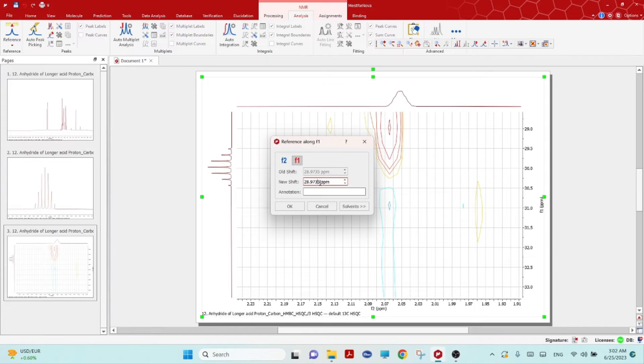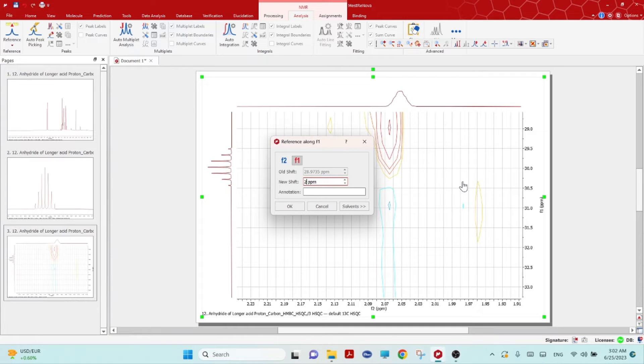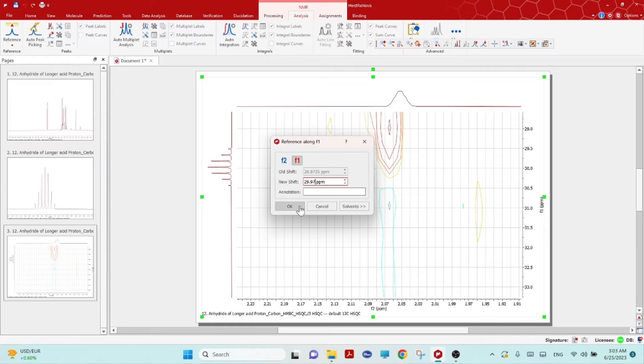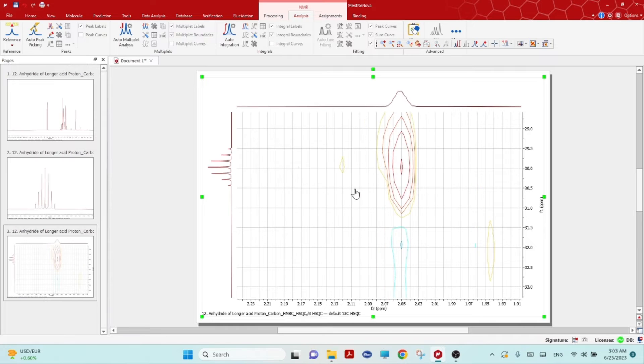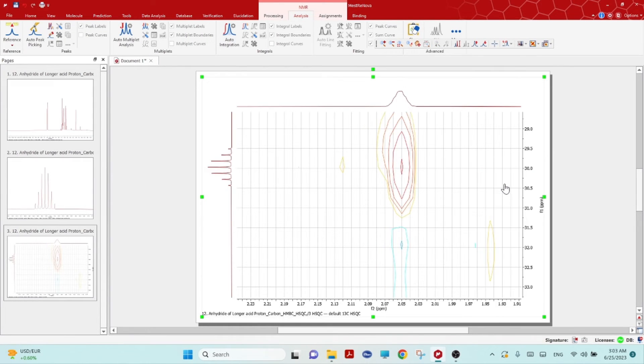Now click on this F1 here. F1 will be 29.97, so 29.97, and then click OK.